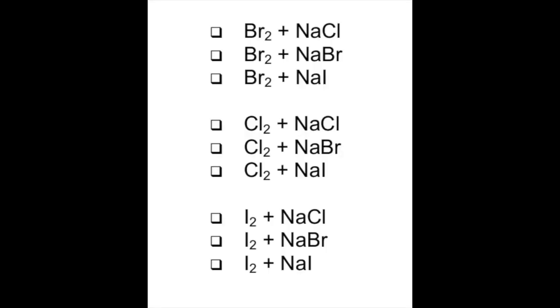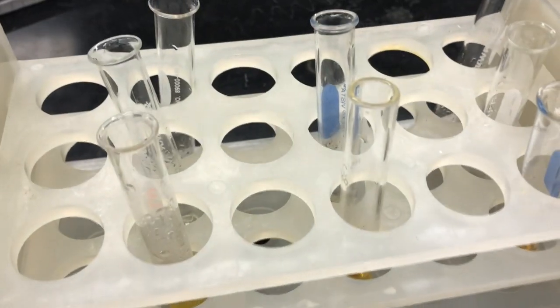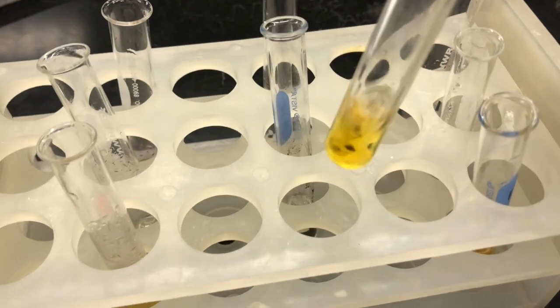Moving on to Group 7A, we will be adding anions from this group to the elements from this group to check for oxidation of the anions. We will be combining them with the diatomic elements and the anions in pairs. We will arrange all of our diatomic elements with hexane in the test tube rack. These test tubes contain the diatomic element, and to that we will add the anions of each group.